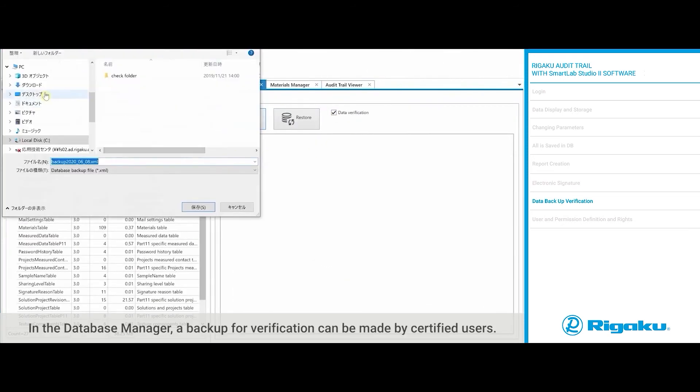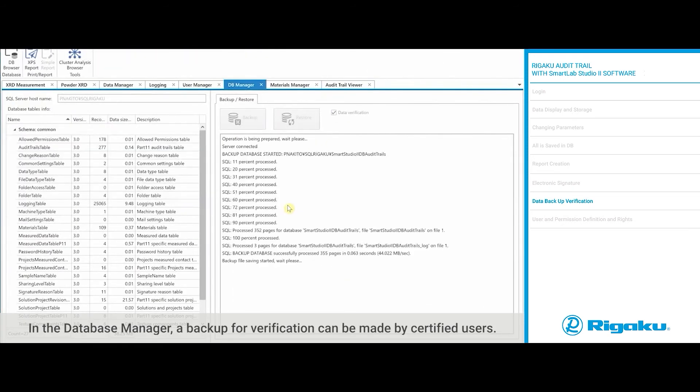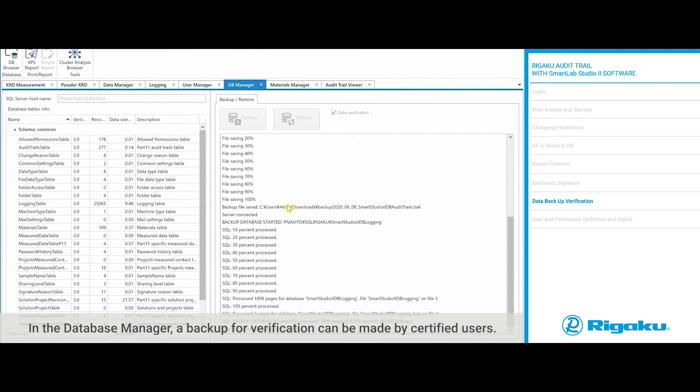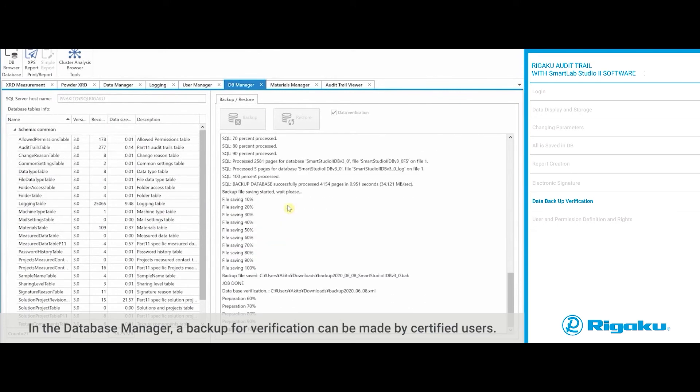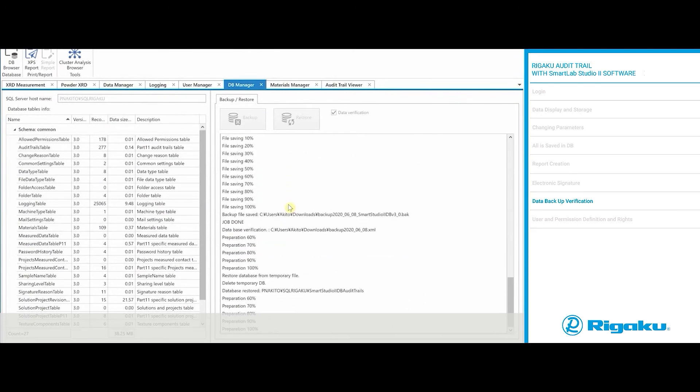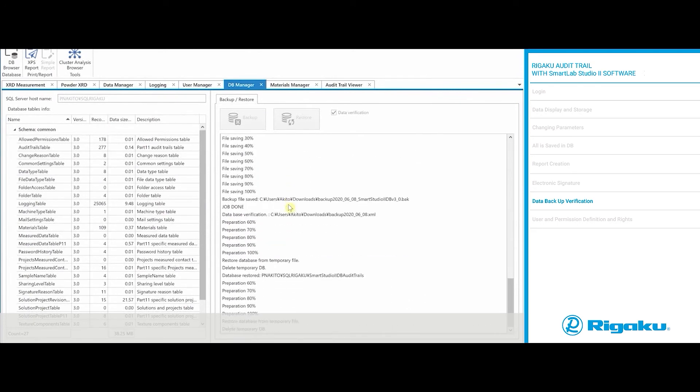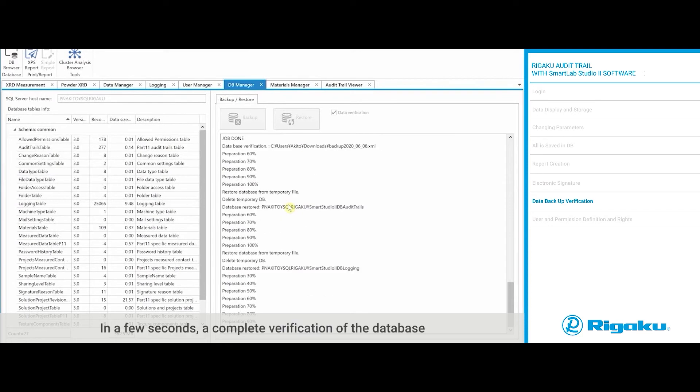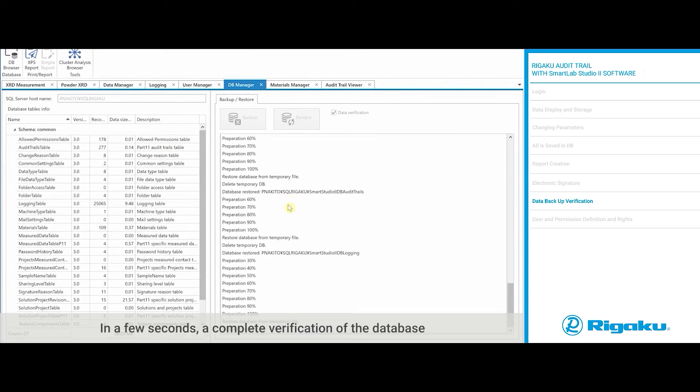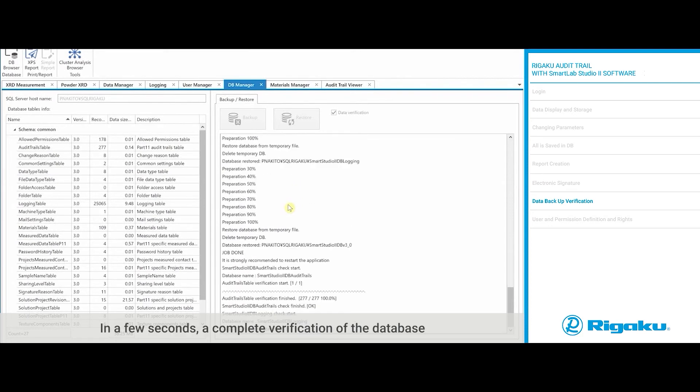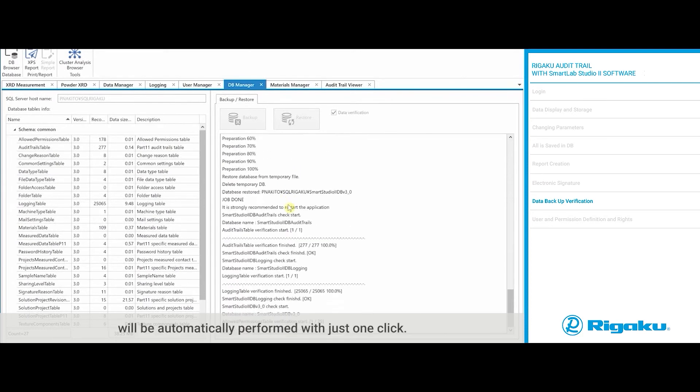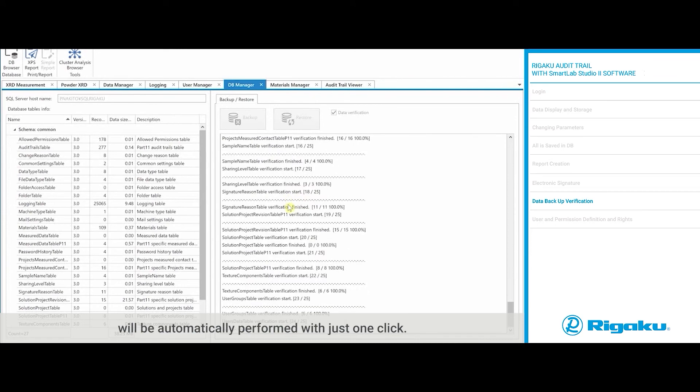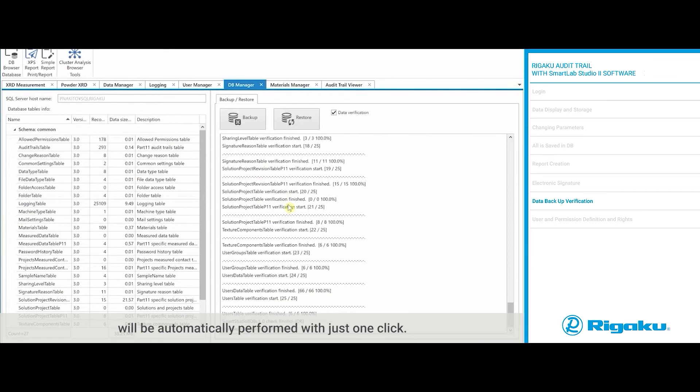In the database manager, a backup for verification can be made by certified users. In a few seconds, a complete verification of the database will be automatically performed with just one click.